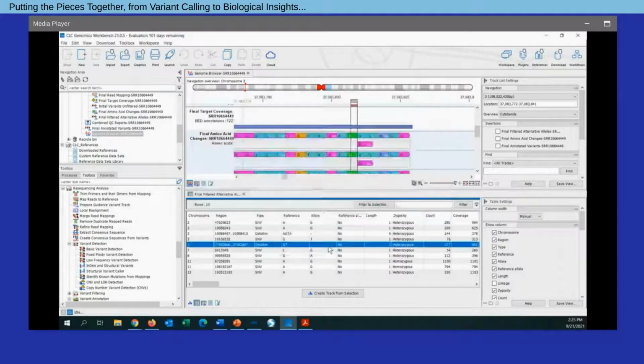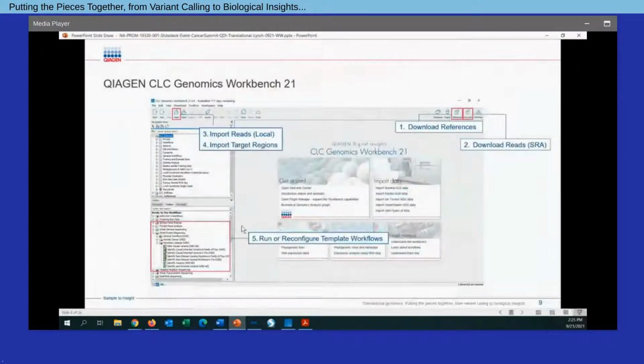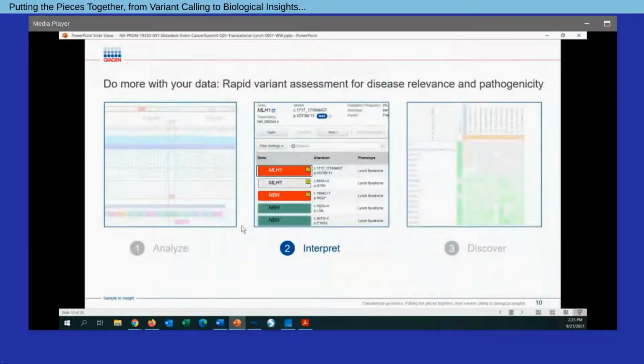And also of note, within the software, we actually have a built-in exporter to transition our variant calls from CLC Genomics Workbench to Qiagen Clinical Insights Interpret Translational. And in fact, let's go ahead and jump back into the slides. And at this point, we can talk about our next step, which is variant interpretation.